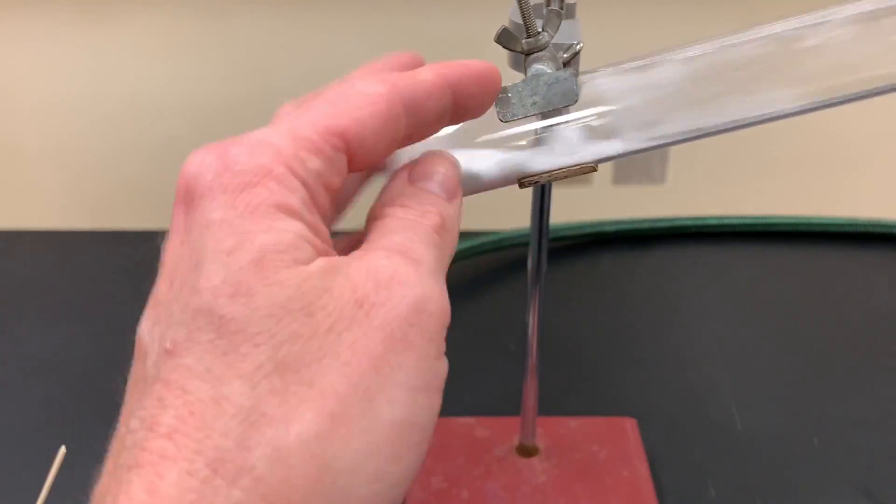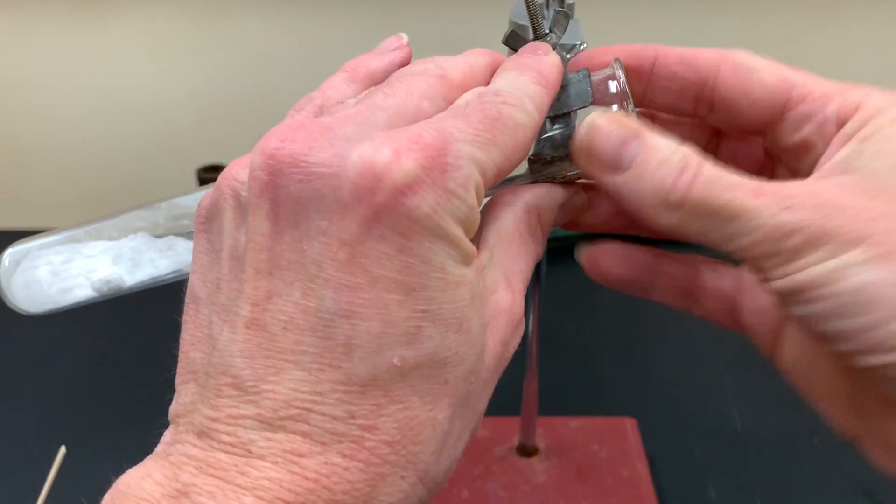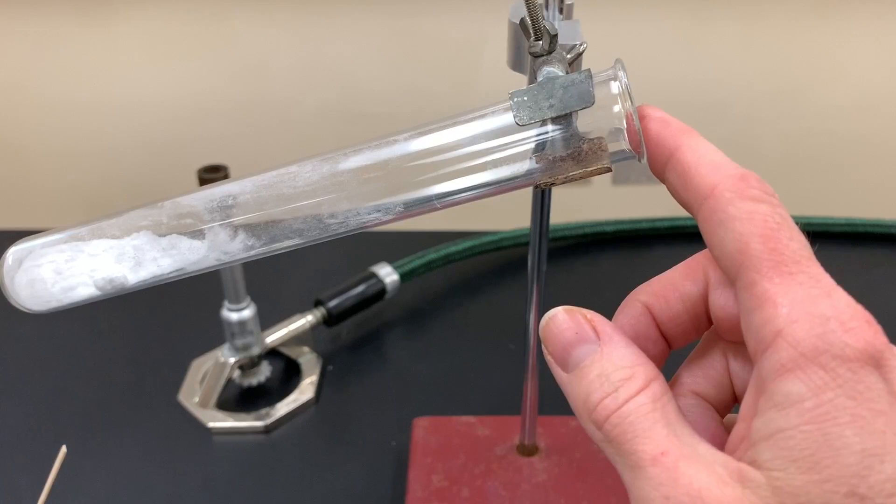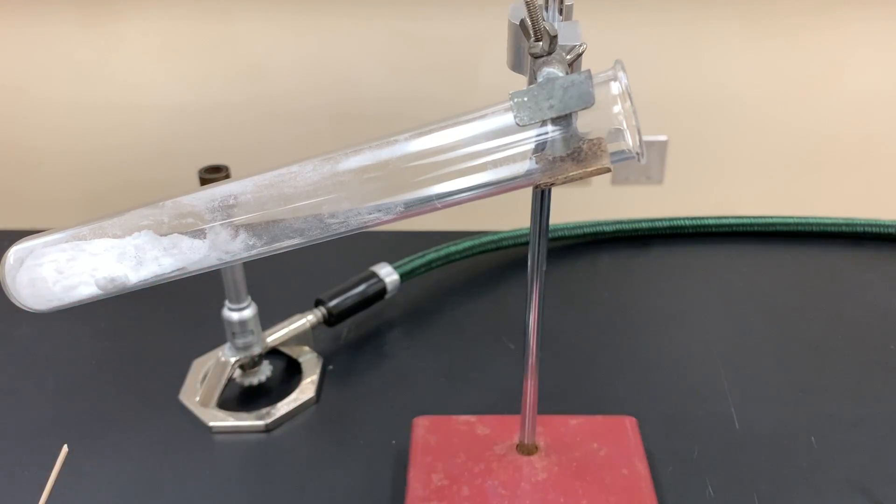You'll want to put your test tube not at a horizontal angle but fairly close like this and clamp it down securely, having this end facing away from others. You're going to put the Bunsen burner under this end and heat it and start the decomposition of sodium bicarbonate.